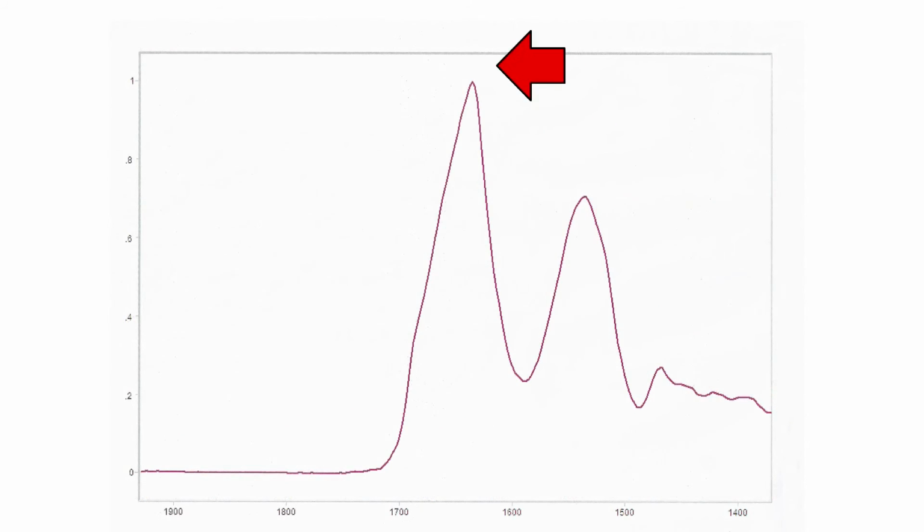So to answer my initial question, the perfect FTIR spectrum is judged by 4 criteria: the ratio of amide 1 to 2, a flat baseline that comes up very slowly, no vapor bands, very good high signal to noise, and, very important, the presence of other amide modes such as amide 3 and the CH stretching bands.